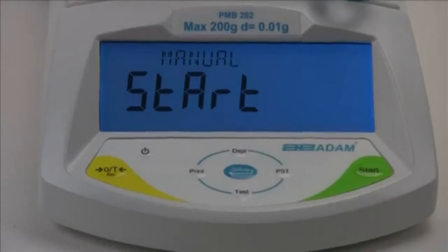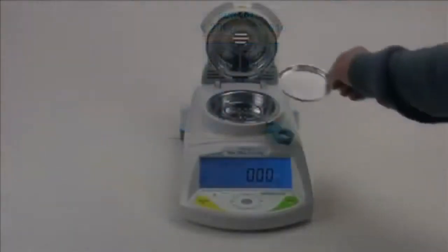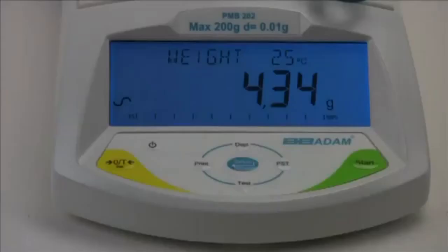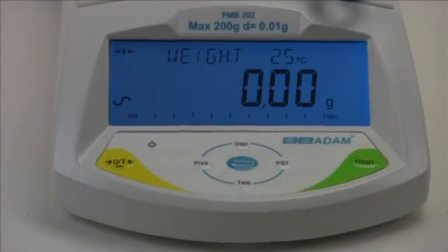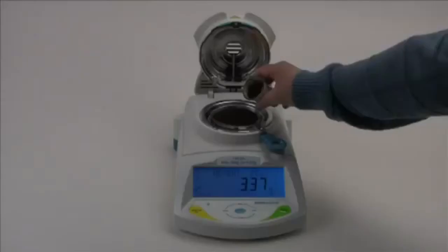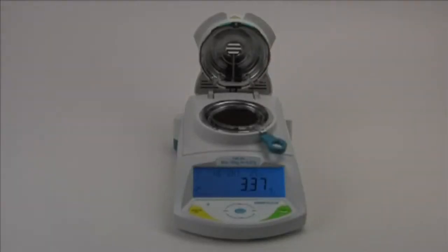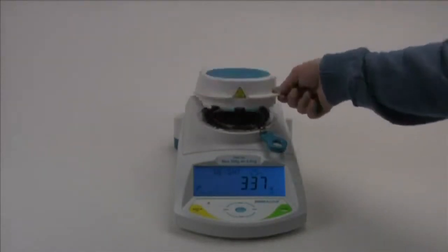And now, to start the test, we will select Auto so the test begins when we close the lid. Tear a disposable sample pan. Add your sample.